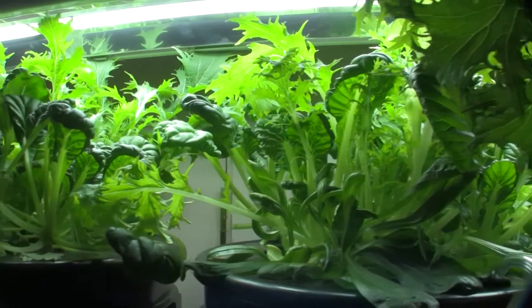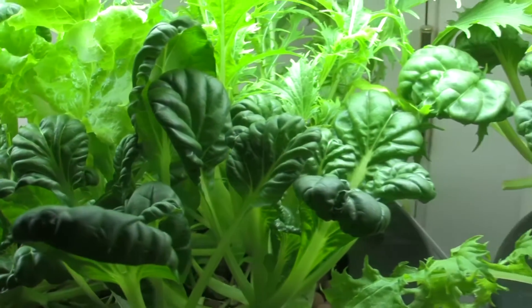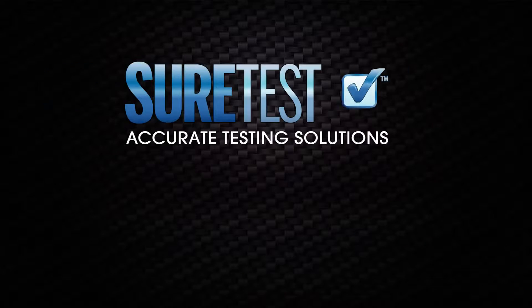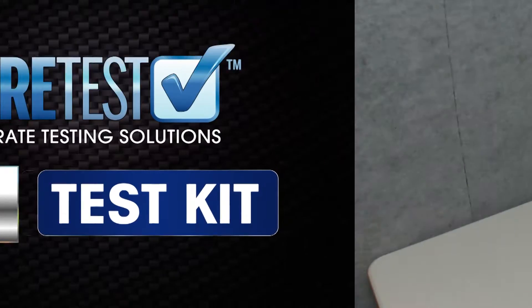One critical aspect of achieving and maintaining beautiful, healthy plant growth is to frequently check the pH balance of the water being used in soil, soilless, and hydroponic systems. The SureTest pH Test Kit is a fast, accurate way to determine the pH of your water or nutrient solution.